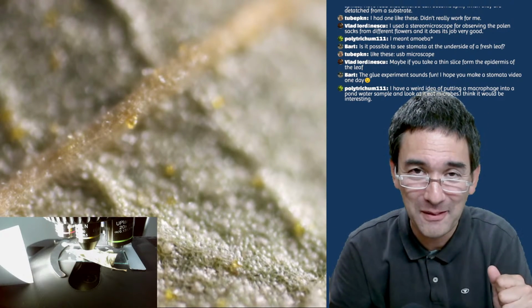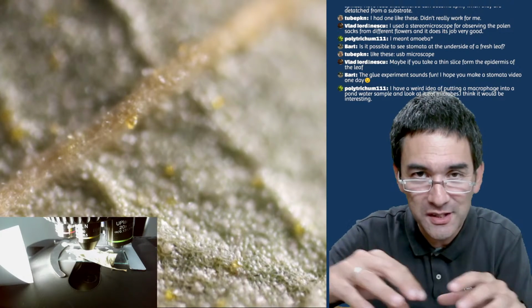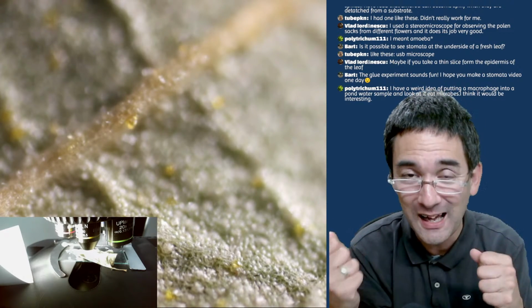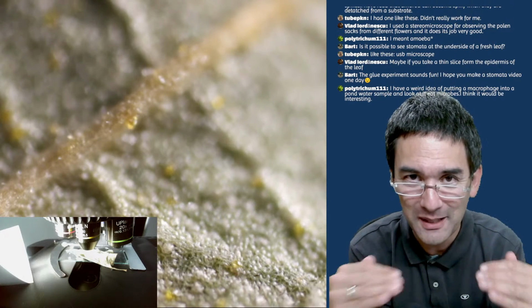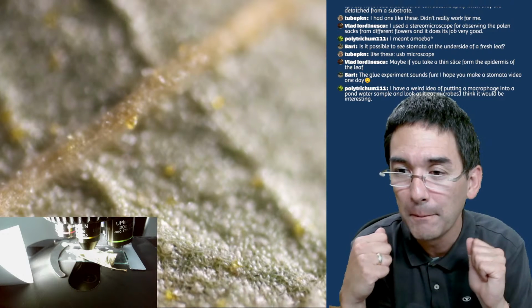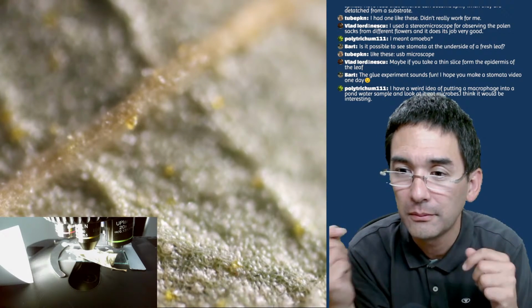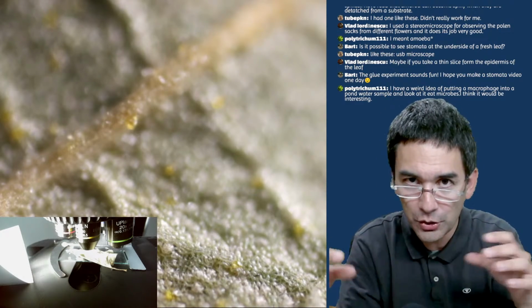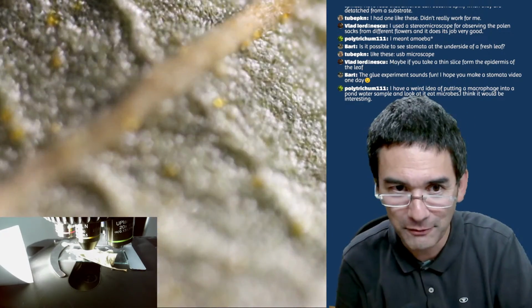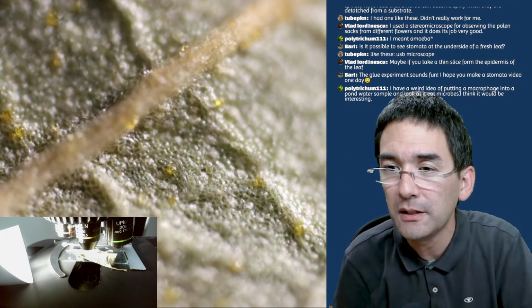Okay. I've made time-lapse videos on my other channel where you can see white blood cells move around on the microscope slide. So it's not surprising. I tried to do that, but the problem is that my slide dried up before I was able to see anything here. But apparently it does work. So you can put blood samples on the slide, and then you watch the white blood cells apparently attack whatever they find. Yeah. So there was also a question about bacteria. How can you see bacteria?